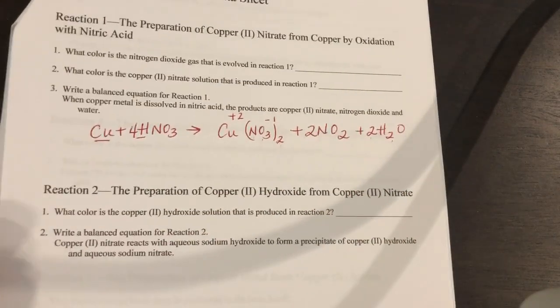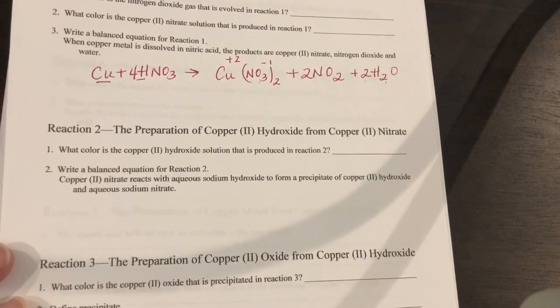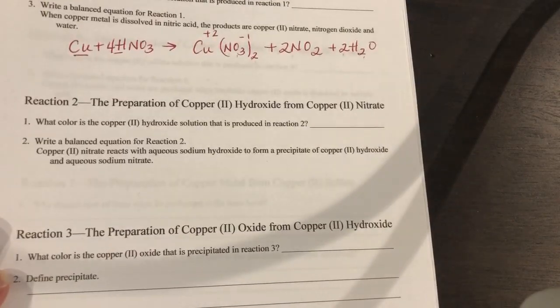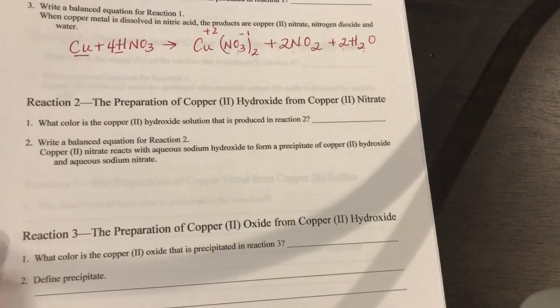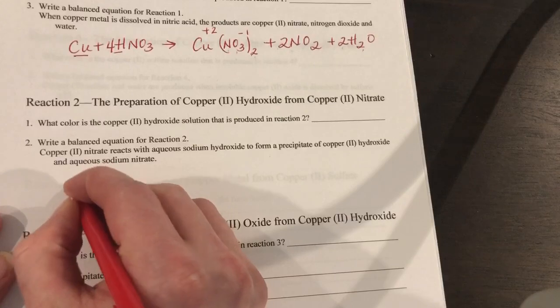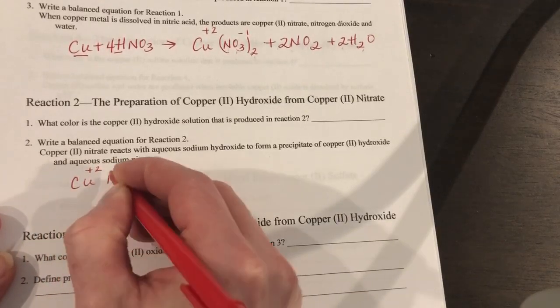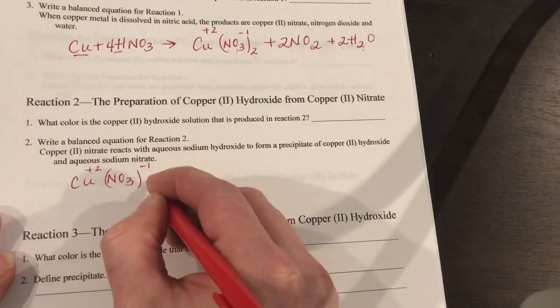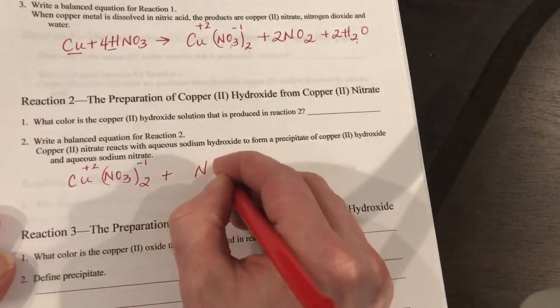Okay? What color is the copper 2 hydroxide solution that is produced in reaction 2? It's that dark blue, flubber looking. Now it says write a balanced equation. So it says we're going to take copper 2 nitrate, and I'm going to react it with sodium hydroxide.